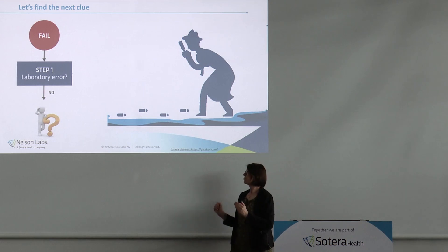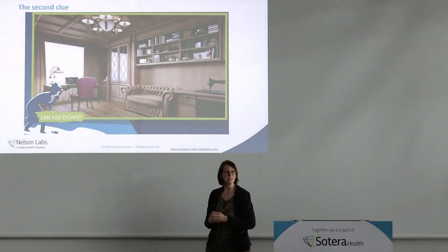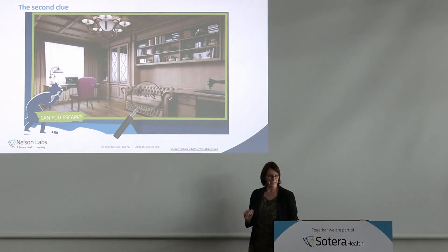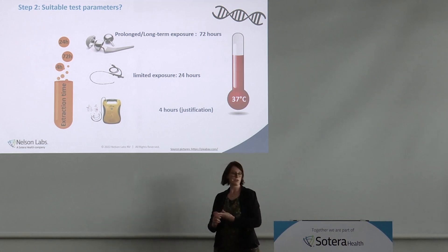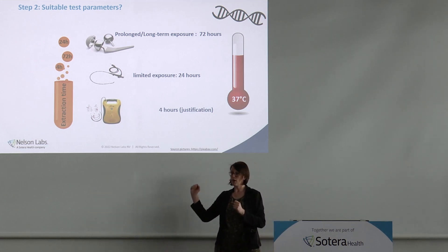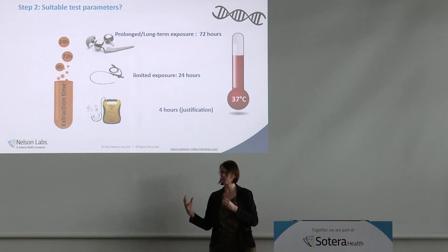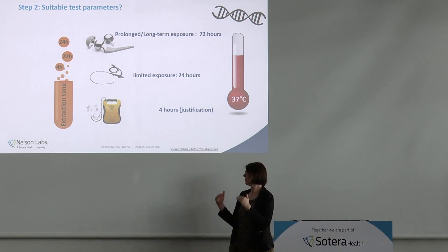What happens if you cannot find a laboratory error? You have to dig deeper. The second clue is the DNA on the couch. You're going to look at whether the extraction conditions were suitable for your device. For instance, the extraction time — ISO 10993 says 24 hours or 72 hours. If you have a short-term exposure device and you used 72 hours extraction time, that's way too long. You can reduce it to 24 hours. Going below 24 hours — minimum is 4 hours — but that needs justification.